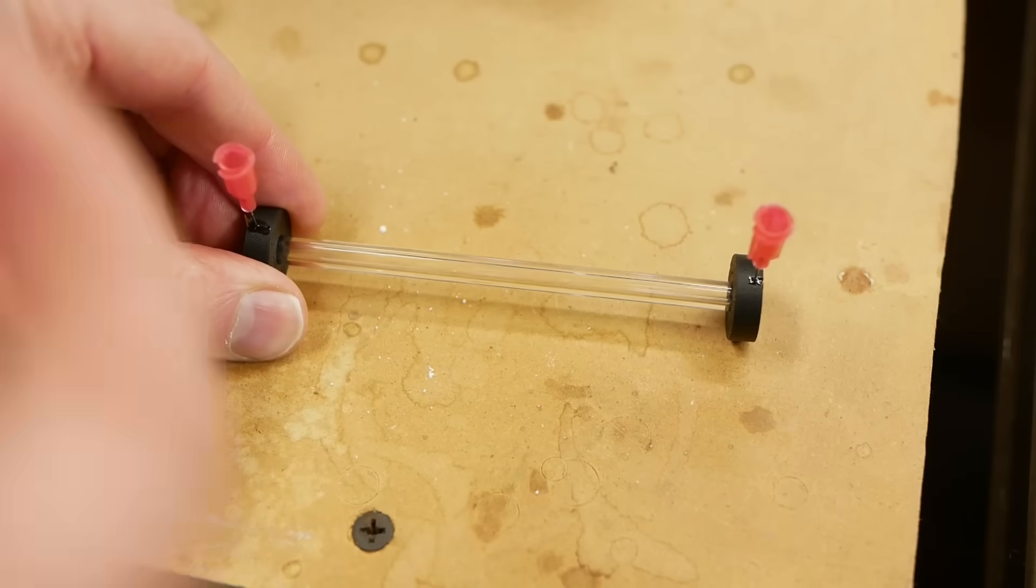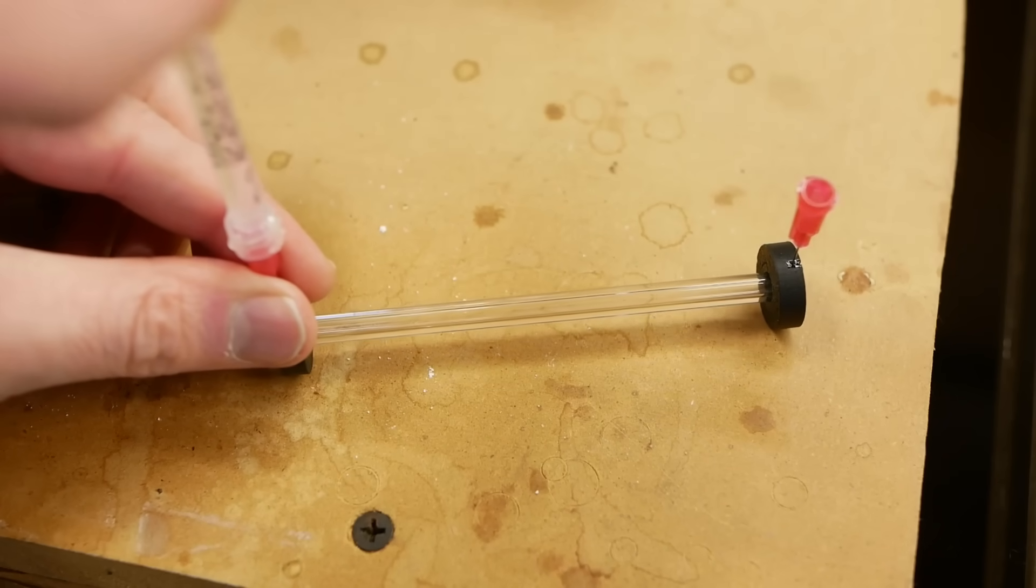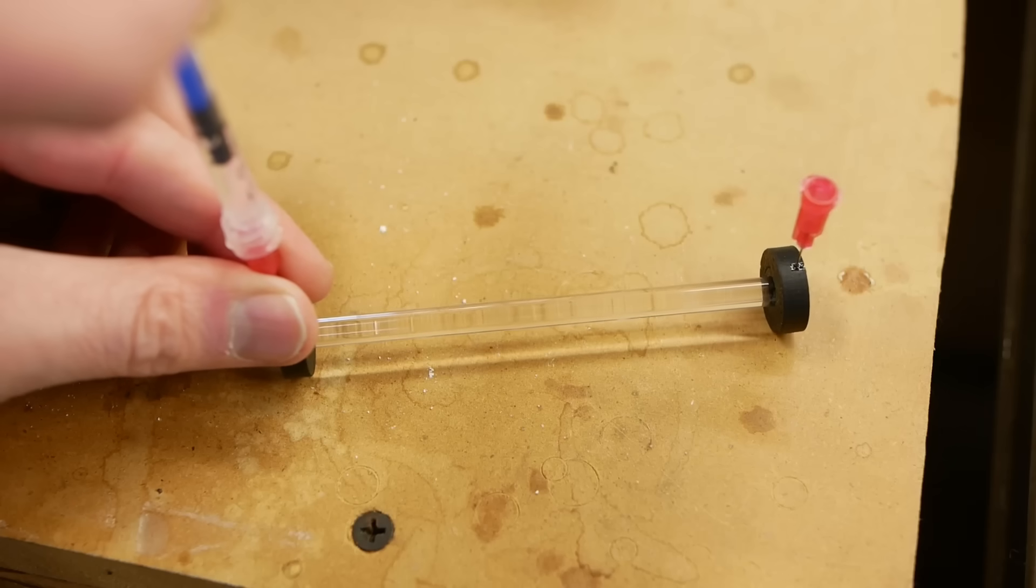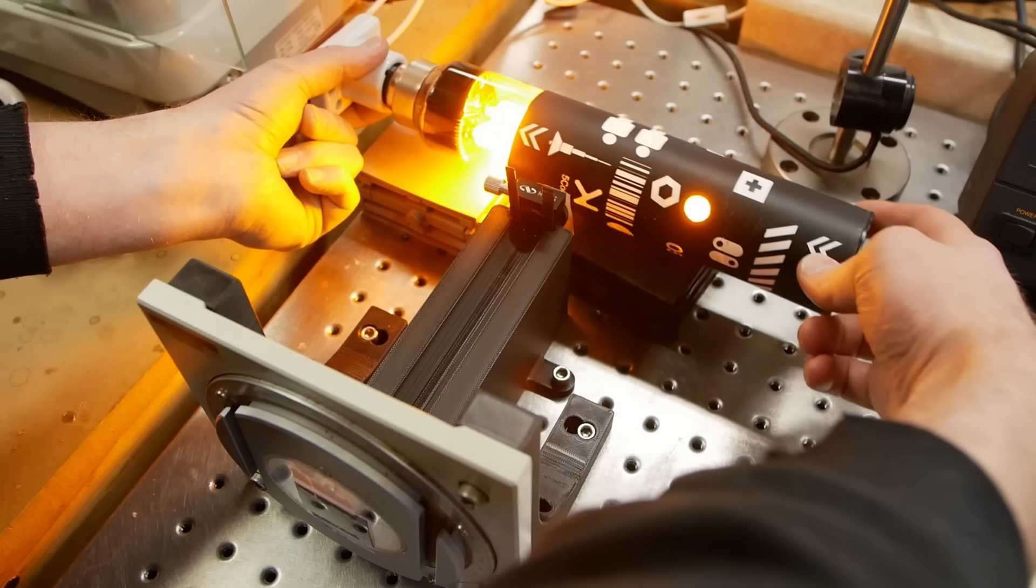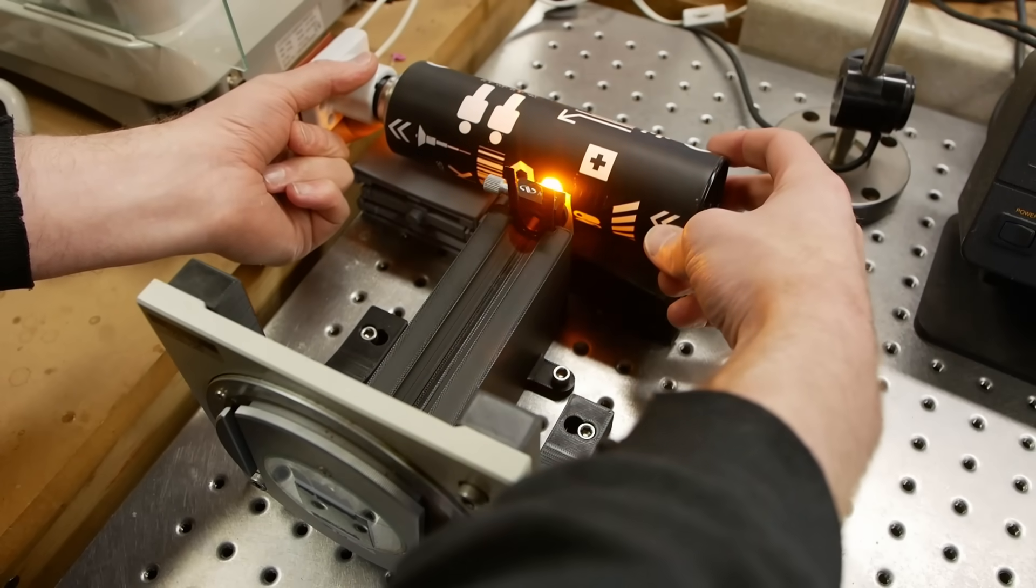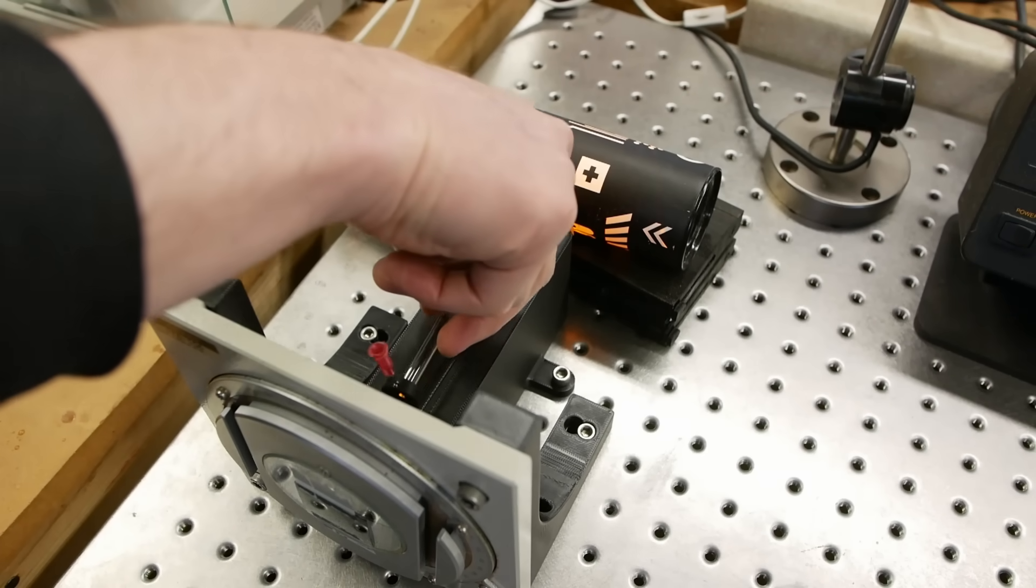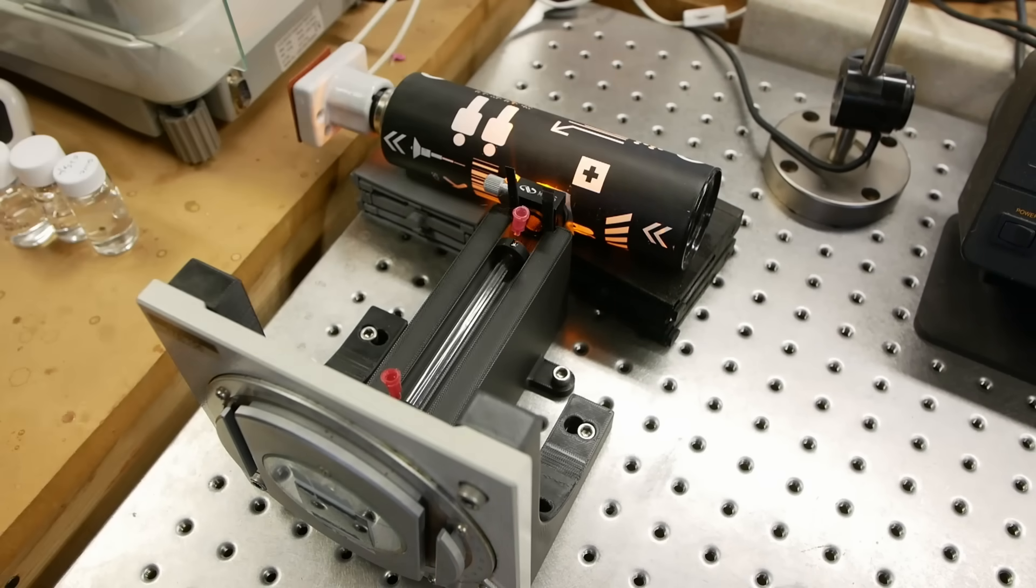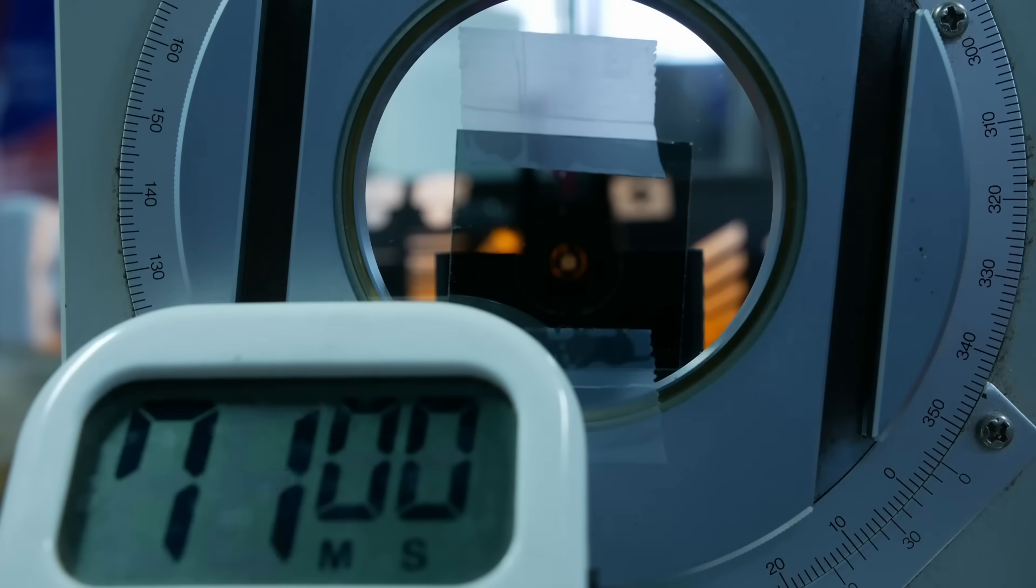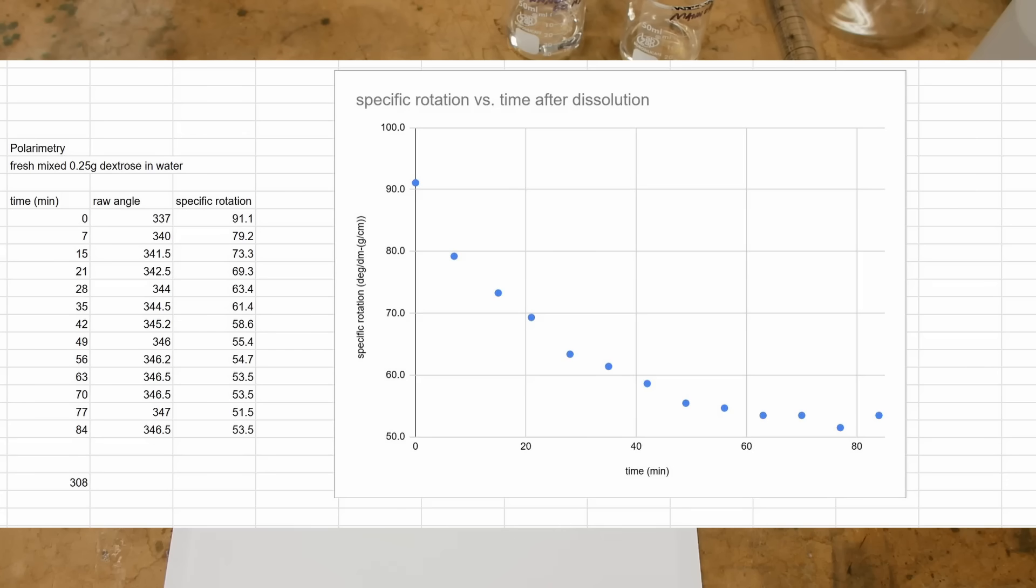So I built a polarimeter, which measures the optical rotation of anything you put in there. And I was surprised that when I mixed up some glucose from the store, just to check if my polarimeter was working, it returned a value that was completely wrong compared to the textbook. This is very strange because it was way off. It was not like a small calibration error. And I mixed up a fresh batch and got the same wrong answer again. So I left it sitting there for a day, and when I came back the next day, I measured it, and it had exactly the correct value.